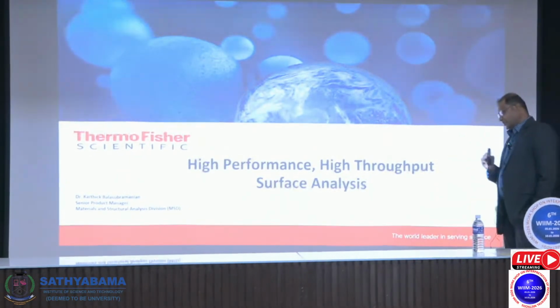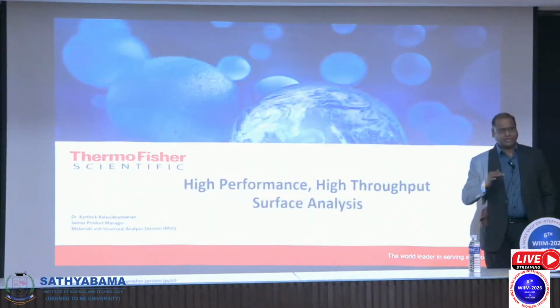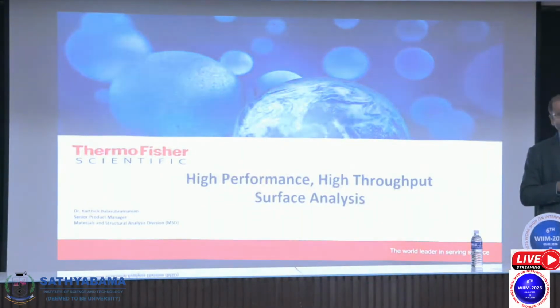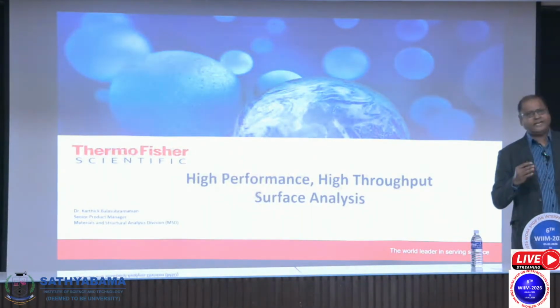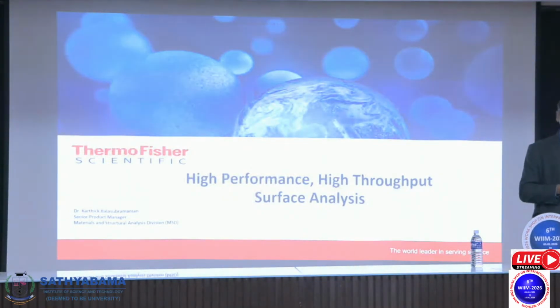We will look at some of the basics of XPS. Most of you might know it. I'm not denying it. Most of you might know it. So the basic slides that I will cover are particularly aimed at the student community who want to get to know more and more about this fascinating technique.